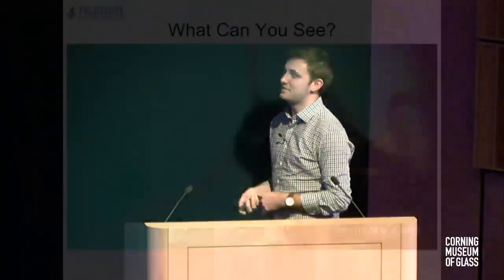So this is just a best in show. This is from a video that The New Yorker made in 2015, but mostly this is just to show you some of the beautiful images we've seen under the Foldscope, or videos, I should say.